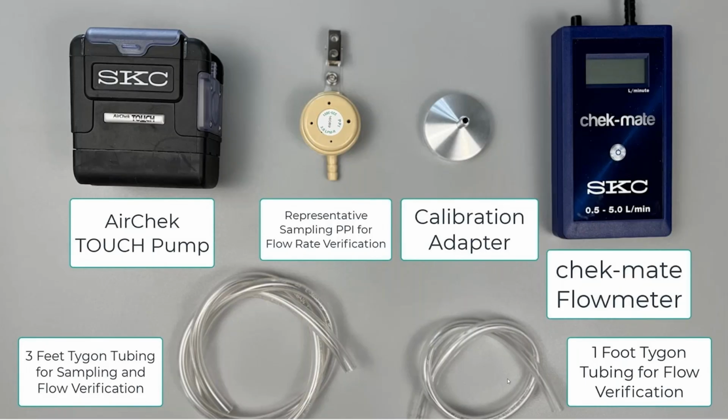You have your calibration adapter. You have a checkmate, which is a flow meter. You have a couple different lengths of Tygon tubing to be able to connect your pump to your calibration device or your flow meter device. Still catch myself saying it. But yeah, so if this is a video that anyone needs, I'm happy to forward the link. It walks you through the entire process, which makes it really simple and really easy.